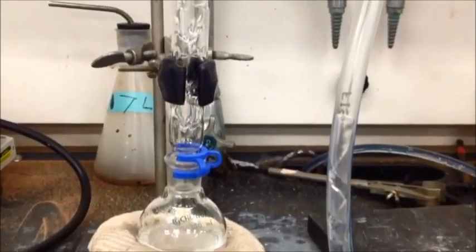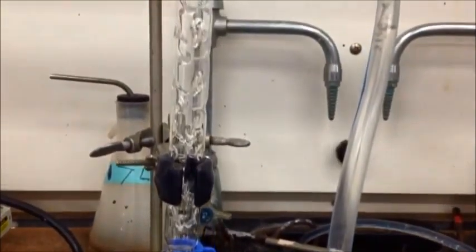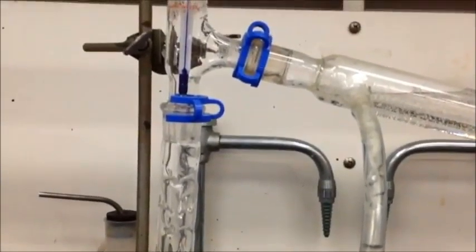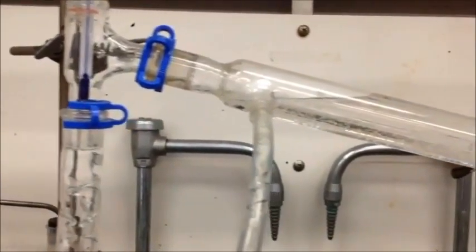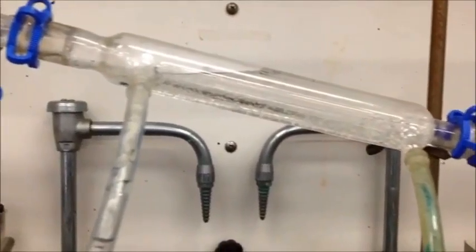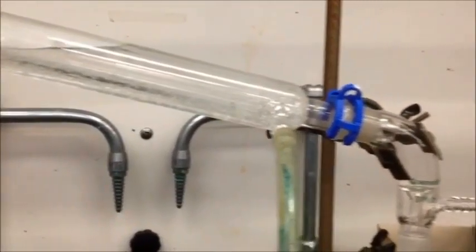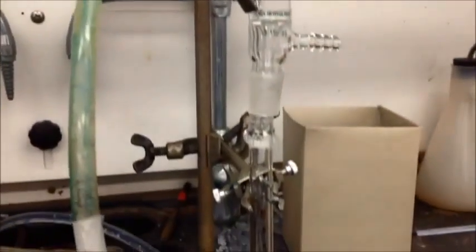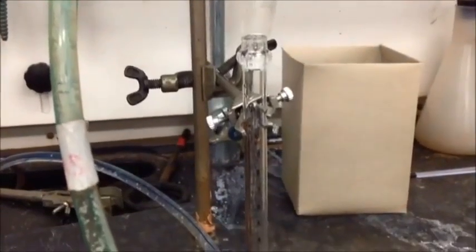Once your liquid has vaporized and moved through the distillation column, it's going to pass through the condenser. The condenser is a long glass tube insulated by another glass tube. The reason for this is that cool water will be passing through the 2 walls of glass, while your vapor moves through the middle. This will cause the vaporized liquid to recondense so that it can be collected in your graduated cylinder.